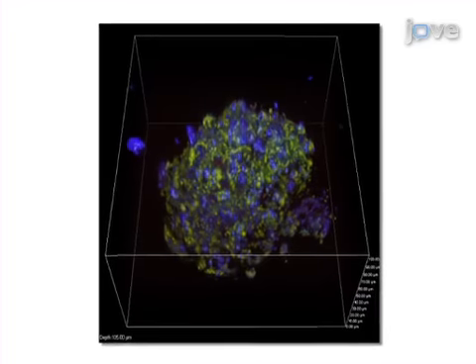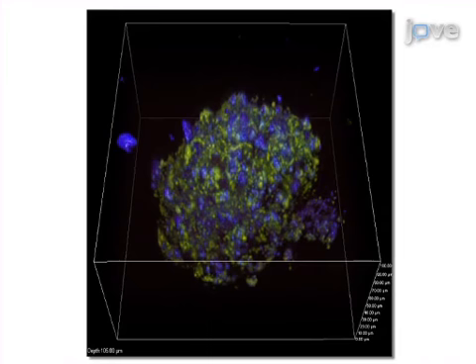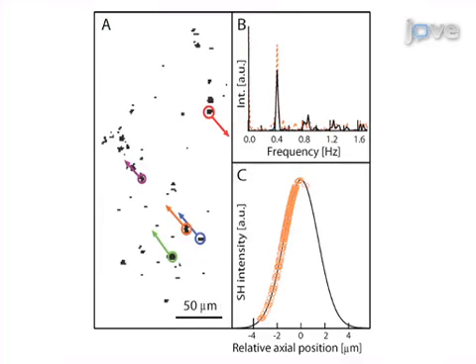Then, beating clusters are labeled with harmonic nanoparticles in order to perform real-time multi-photon microscopy. Results obtained allow the analysis of spatial elongation and frequency of cardiac contractions at the microscopic scale.